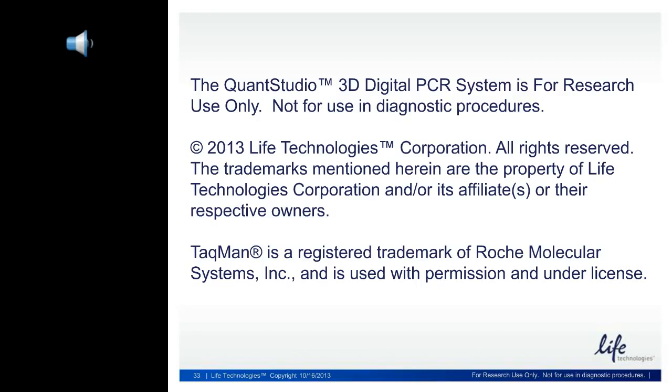Thanks very much, Steve. We do have a question that's come in from Agnes, and the question is, what is the primary difference between this digital PCR method and the standard ABI allele discrimination assays, other than that with the digital PCR method, you're amplifying in 20,000 wells.